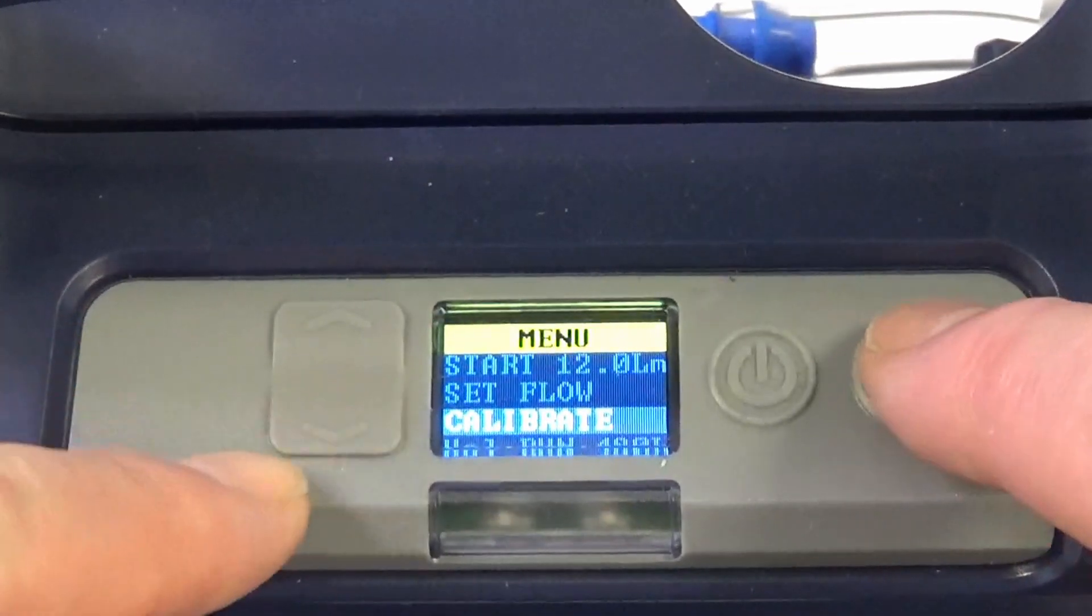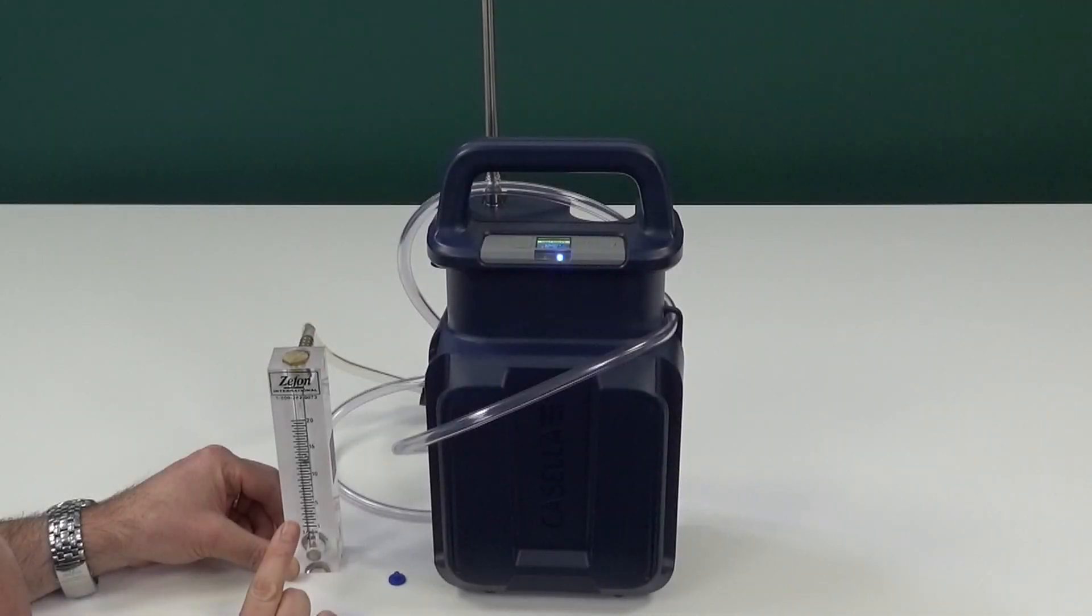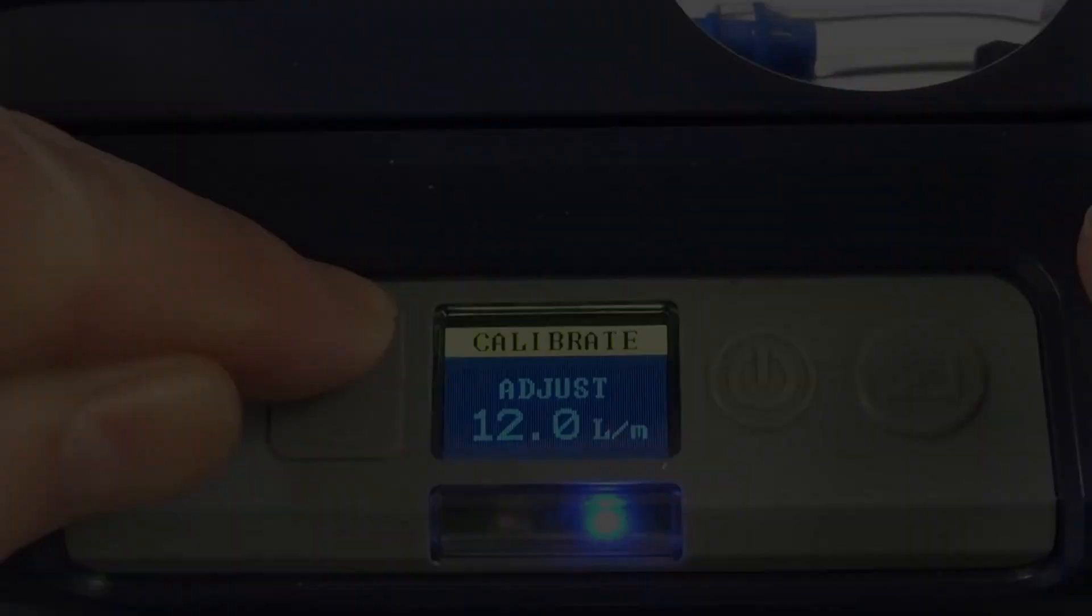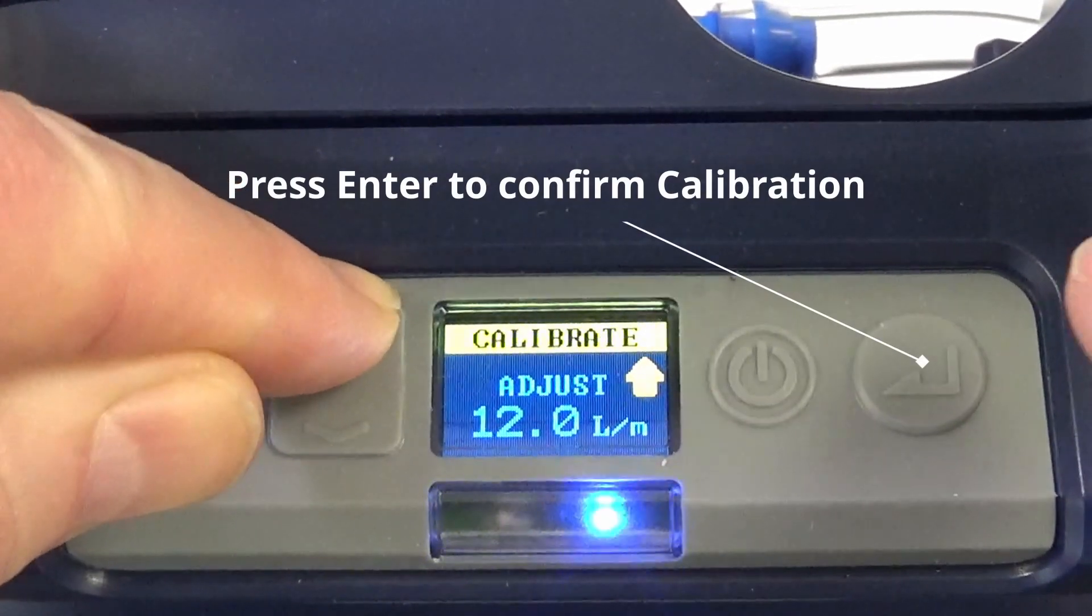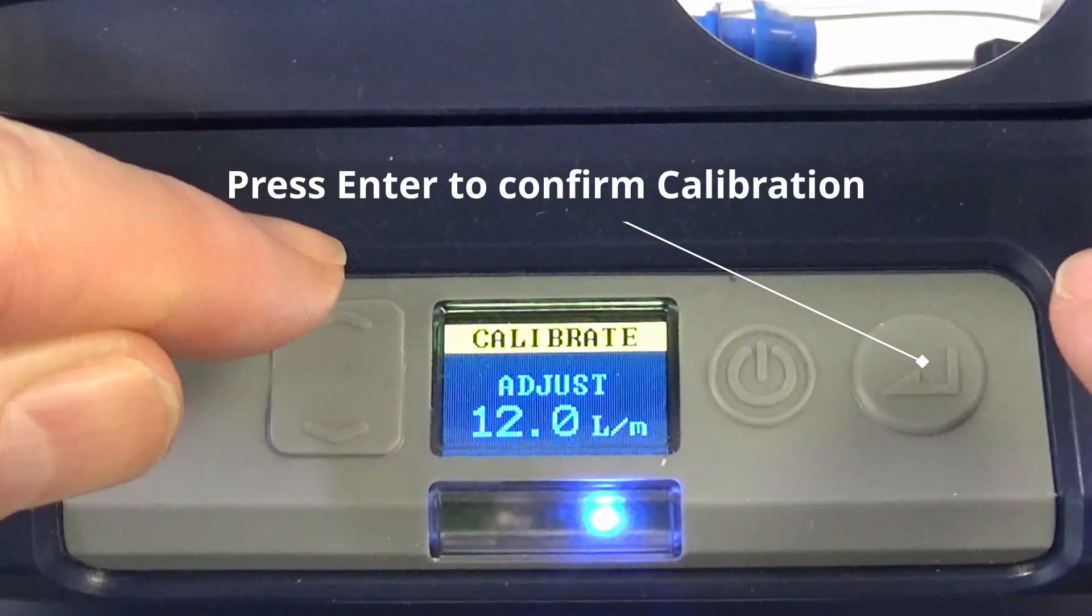Then select calibrate from the menu and, reading the flow from the centre of the bob on the rotameter at eye level, use the up and down cursors to adjust the flow to the required level.